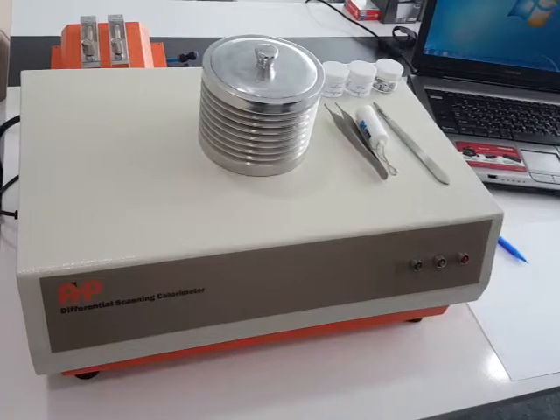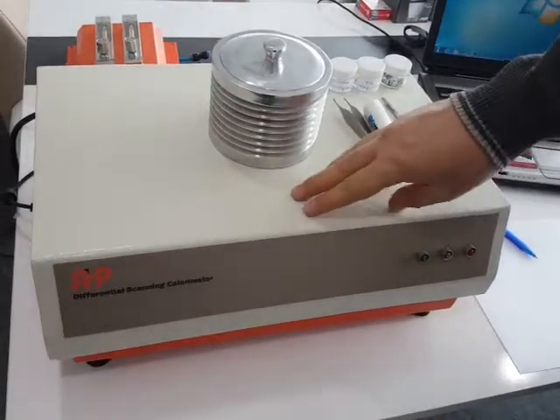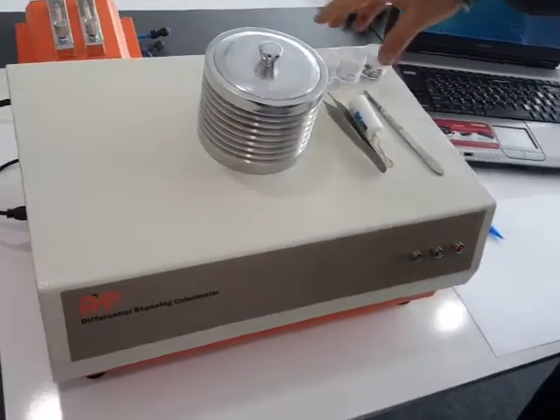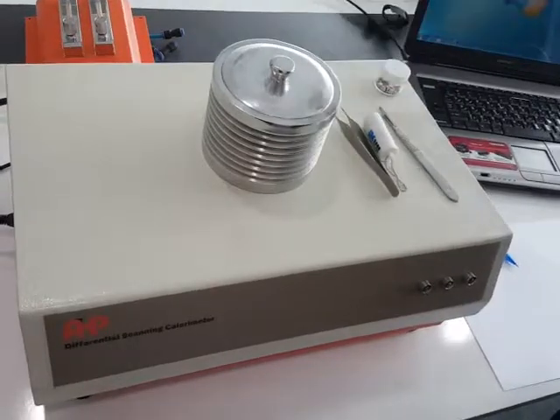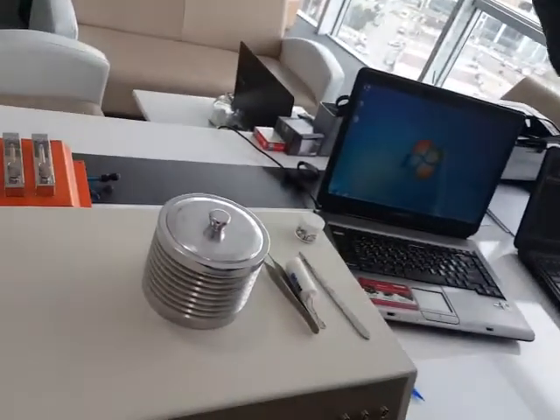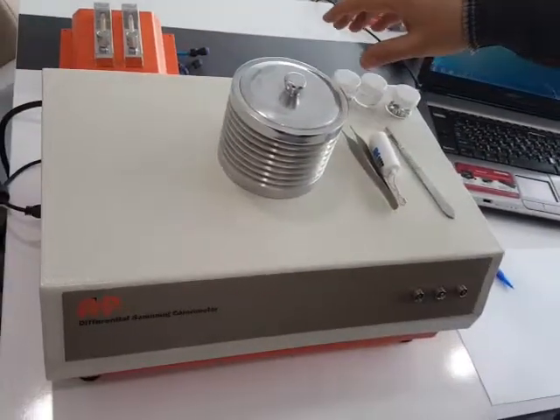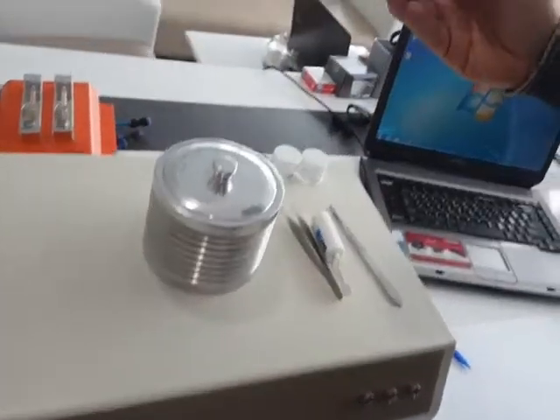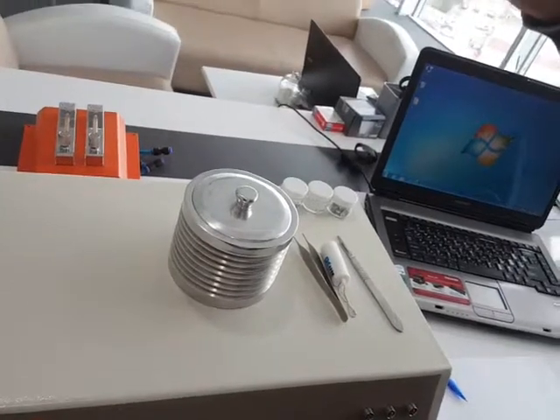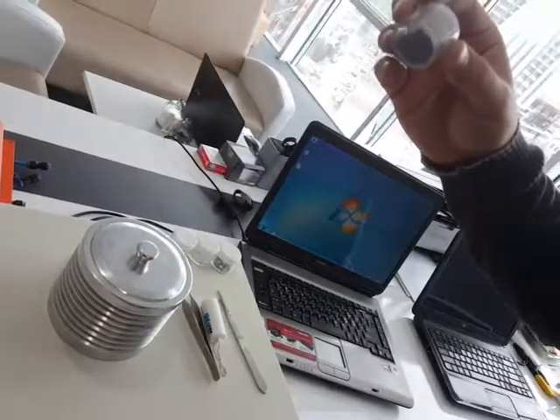The standard delivery of the machine is a basic machine — the structure body. It comes with specific standard materials for calibrating the temperature, including aluminum pans, and also a standard raw material for checking the accuracy of the measurements.